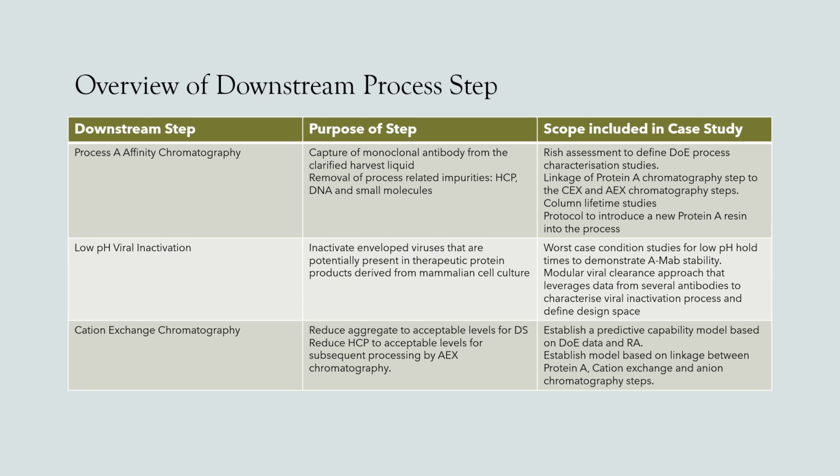Your low pH incubation is where you perform your viral inactivation. These are specific to enveloped viruses, and this is to reduce the potential for adventitious agents that may be or could be present in mammalian cell cultures.